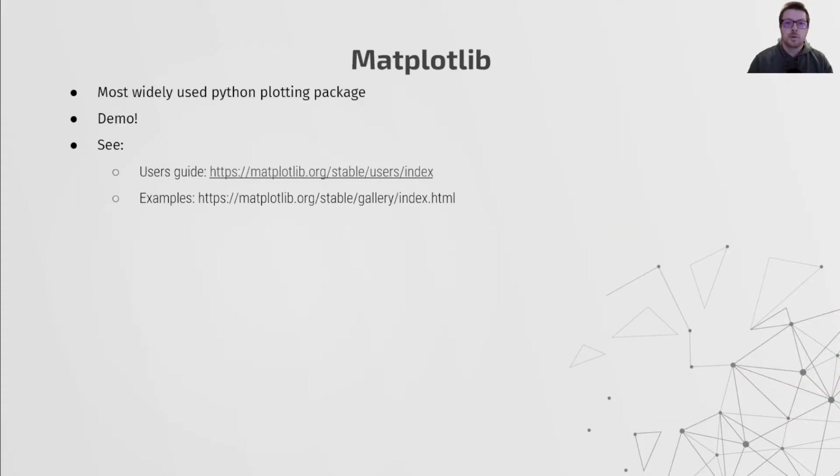The last package I want to introduce before we get to our live coding example is Matplotlib. Matplotlib is probably the most widely used Python plotting package. I think it is best to dive right into a demo to see how it all works, but I'd also like to point out a couple of resources on the Matplotlib website, shown here. In particular, the example section.